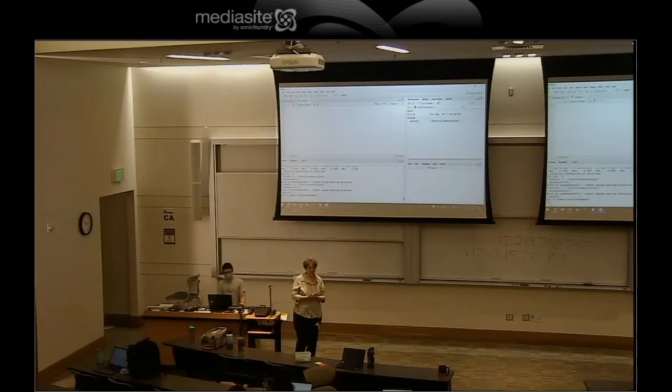We want to instead make it go somewhere else, because if that position is set to, say, your desktop, you don't want everything you're about to do to go on your desktop. You would be lost and not be able to find anything. It's like that lab mate who sticks everything in the fridge without putting it in a box. Anybody got one of those? Yeah, that's you. So don't do that.